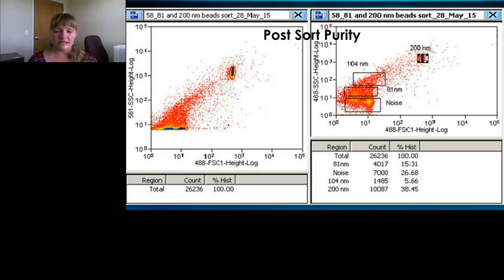However, the noise is impacting our purity measurements. Generally, you run purity, you hide the noise, and you can't do that. So what we're going to have to do is we're going to need an additional analysis package due to the nearness of that population to the noise. These sort outputs were then analyzed by dynamic light scatter on the DelsaMax.